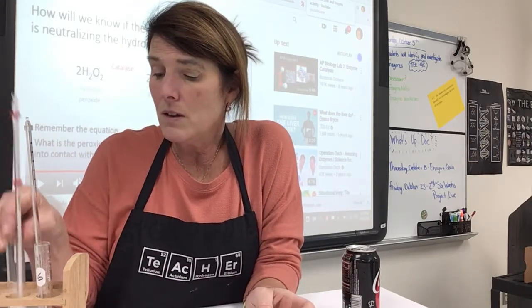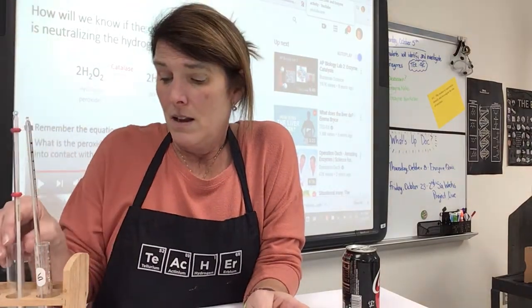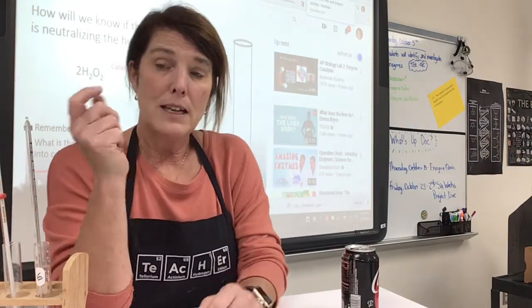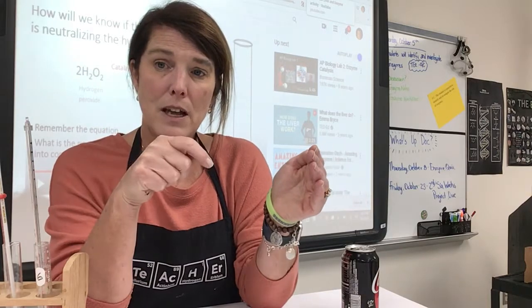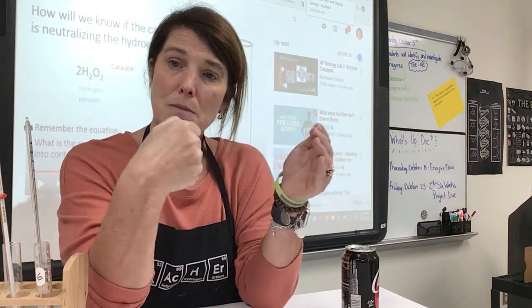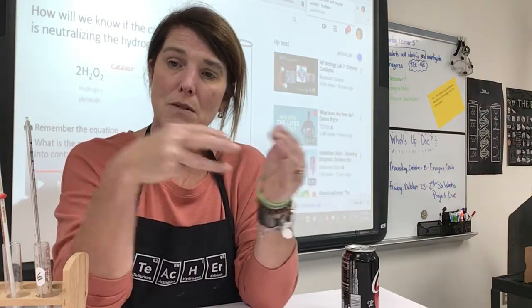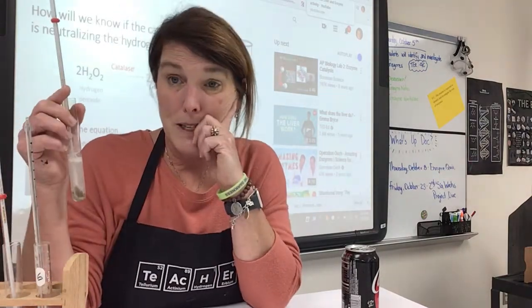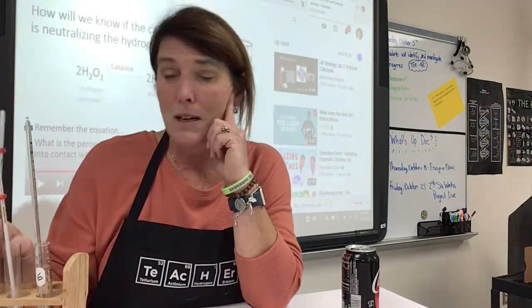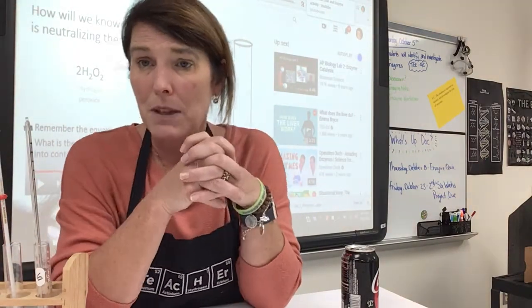We cooked it, which means we took that key, like if catalase is the key and it had a specific shape and it was supposed to fit in a lock and be a perfect fit, and we messed with the fit and it doesn't fit anymore. We did the same thing when we kept it in acid. Acid, you can imagine, definitely changed the shape of that key.